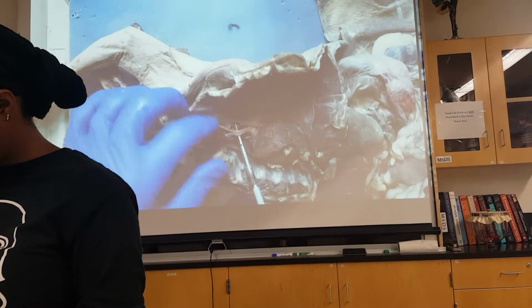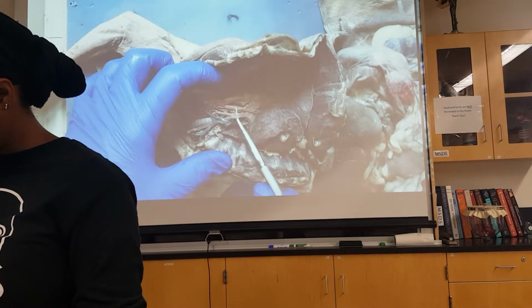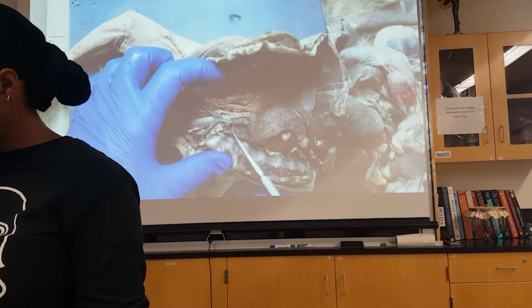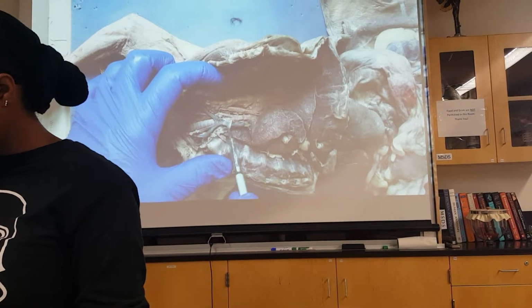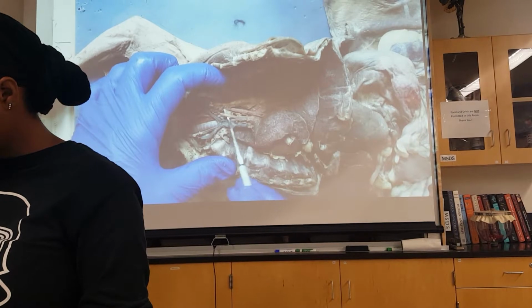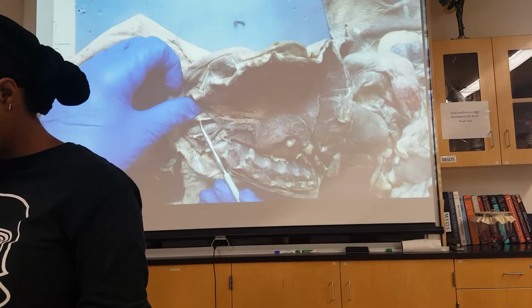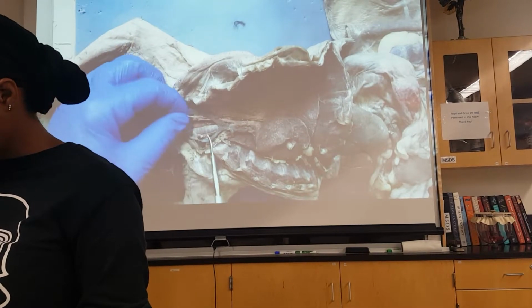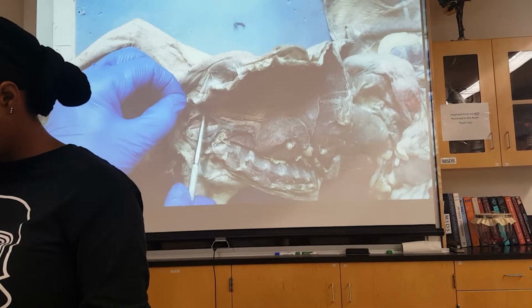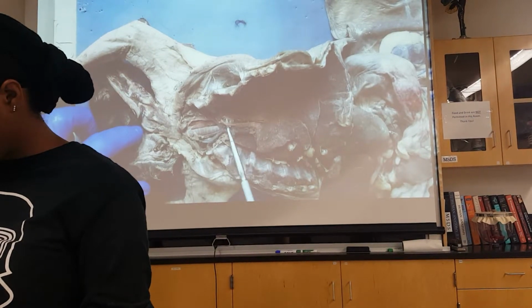And so there's two branches in a cat, there's three branches in a human, but this brachiocephalic in the cat is then going to branch 3 times. This one, it's branching not all the same point, but here is the left common carotid, and you can see it coming up through the rest of the neck here, like this. So it's headed for the head and the brain.